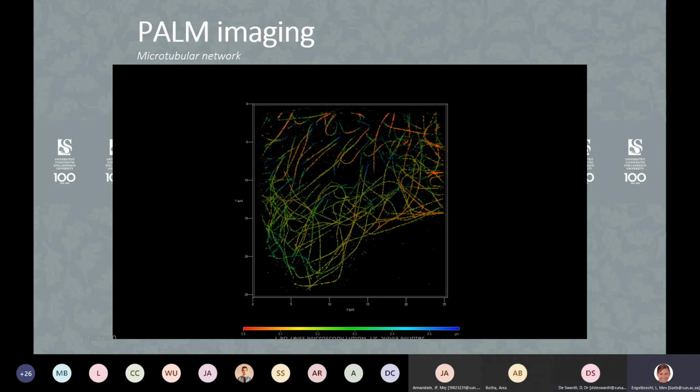This is a general term. Bleaching means every fluorophore is light sensitive. Sometimes the light, whether it's UV or your laser light, and even in normal confocal imaging, you need to be careful of bleaching. You don't want to change your fluorophores to a state, a chemical conformation, where they actually get damaged by light. So they change in some way where they don't fluoresce anymore. They are not capable of being excited by laser and fluorescing anymore. In this case, bleaching would mean that they are so completely damaged that they would not fluoresce anymore. But that is slightly different from the dark state. The dark state can often be changed back into a fluorescent state as well. I hope that answers the question to some degree.